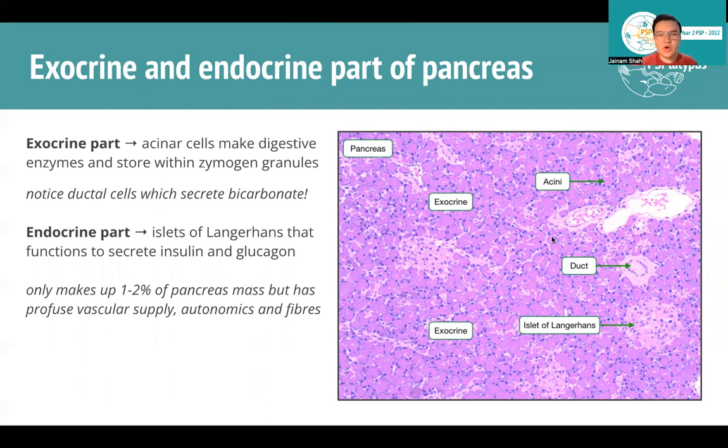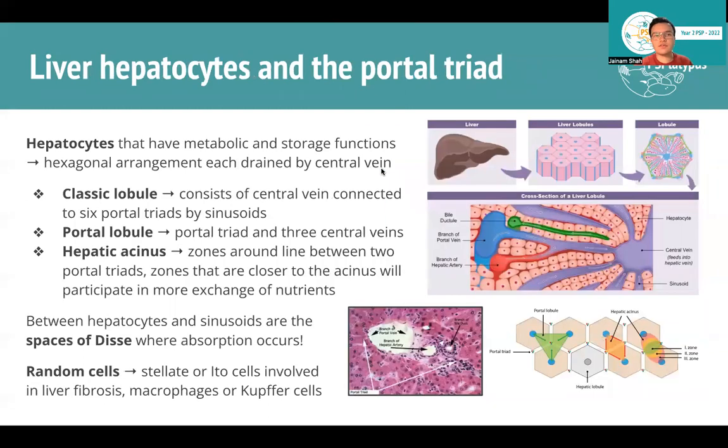And that's pretty much it. Hopefully that was instructive. I only focused on the pancreas and the liver for the accessory organs because they're the only ones that we really covered and the ones that you need to know. You can have a look at the gallbladder if you want. Another really good one to keep in mind is the spleen, because it has a way of dealing with encapsulated bacteria, which I've seen come up as a question once. You've got the white pulp and the red pulp, that kind of thing. But really the main thing is the liver and then the other parts of the GI tract.